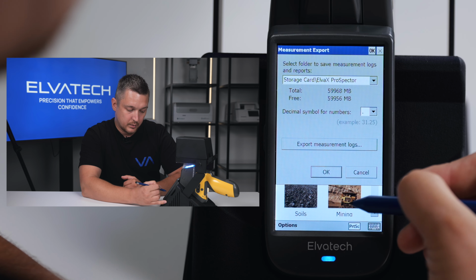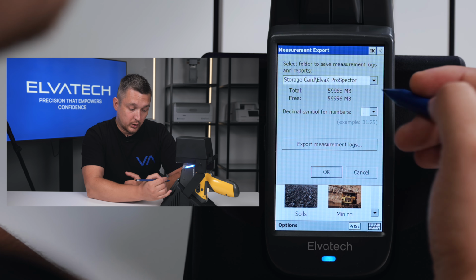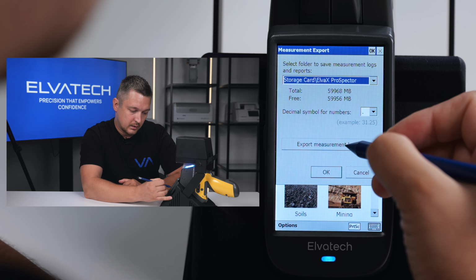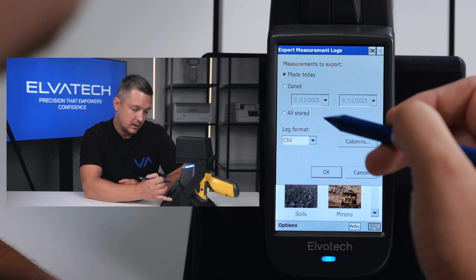Measurement export. Here you can choose where you want to export all your measurements. You can add a network folder and share them instantly on your network folder. You also see the available space of the memory, free and total space, and export. And here we have the button export measurement logs.